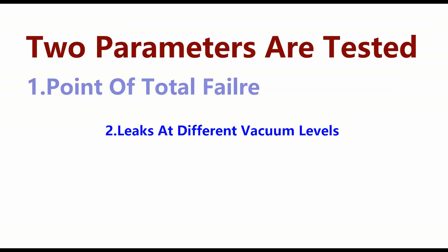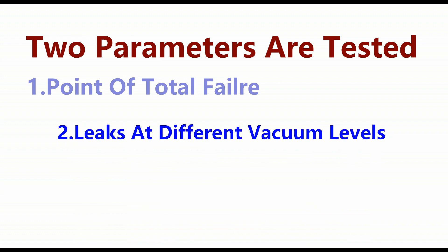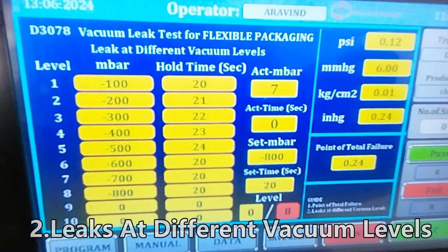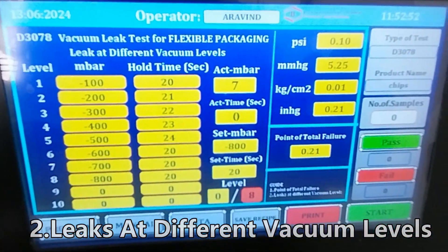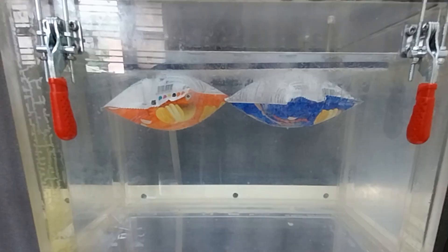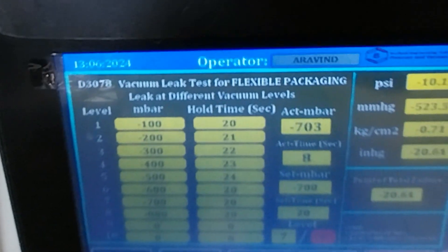Once the level of ultimate failure under vacuum is determined, it's time to check for leaks. We recommend subjecting your flexible packages at different levels of vacuum so that all possible points of failure are accounted for. There may be leaks at different vacuum levels, such as minus 100 millibar or minus 200 millibar. To ensure thorough testing, hold the package at each vacuum level for at least 30 seconds. If no leaks are detected at a given level, increase the vacuum to the next level and repeat the process. Continue this until you have tested all required levels.